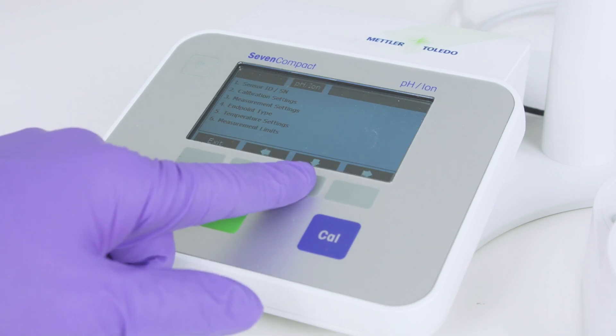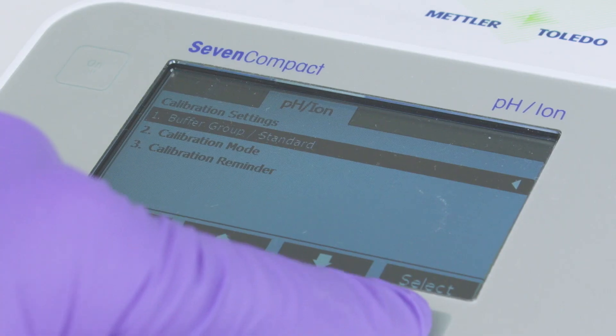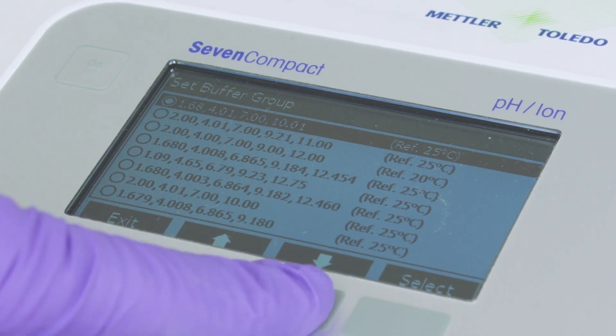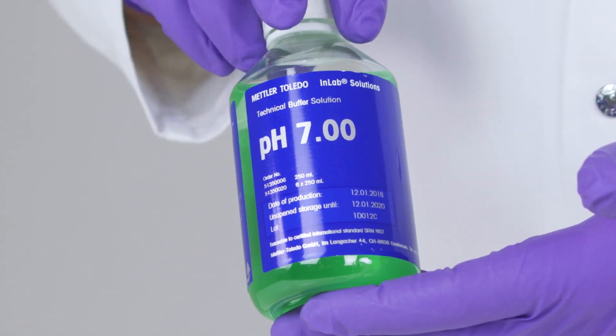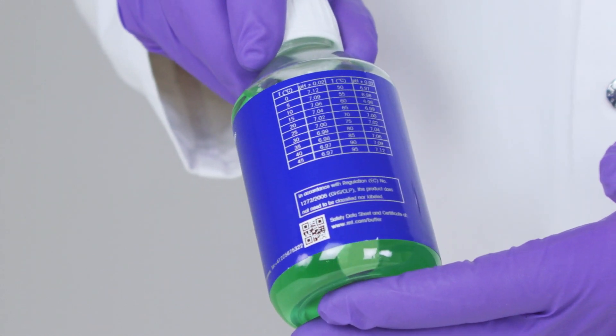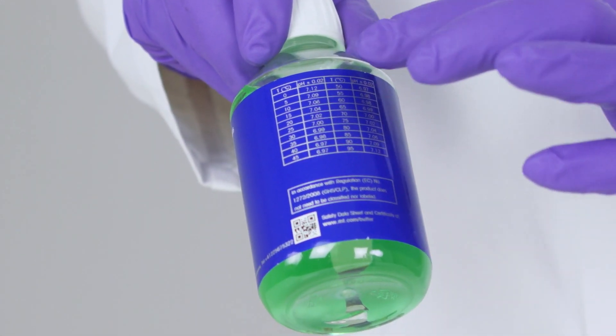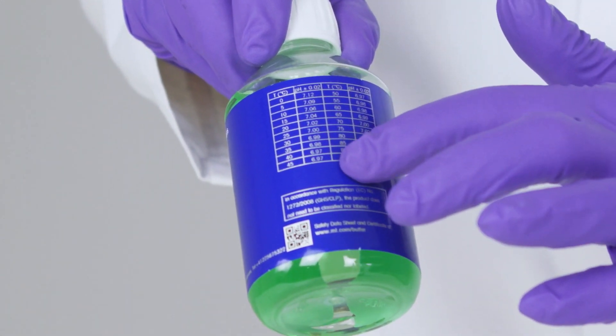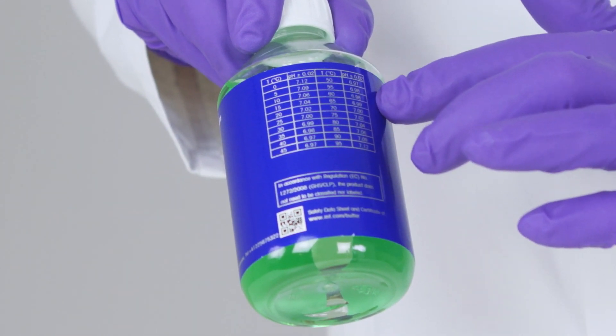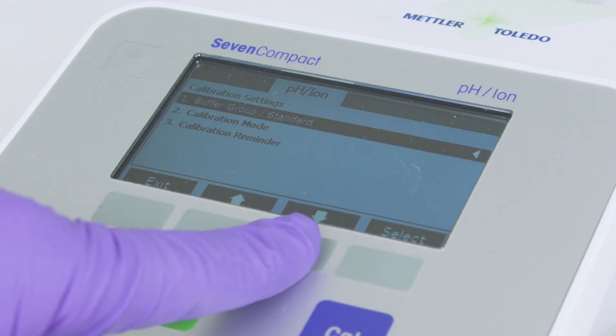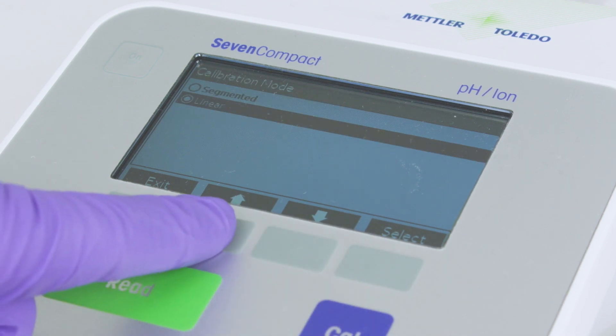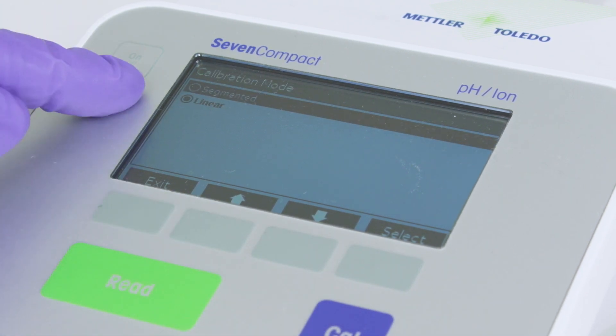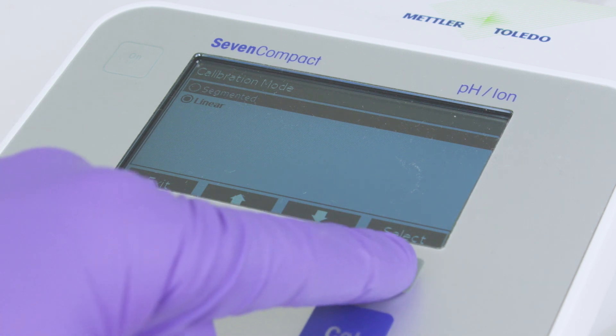You can set the buffers you wish to use by choosing calibration settings, then buffer group, then choosing from the list of standard buffers. It's really important you make sure the buffers you select include the ones you're actually using, or you'll get inaccurate results. By selecting the right buffer group, you're telling the meter to account for the temperature dependency of the buffers in use. Next, you can select from two calibration modes. Linear calibration is the more common mode, whereas segmented mode is best suited for wide pH ranges, including very high and low pH values.